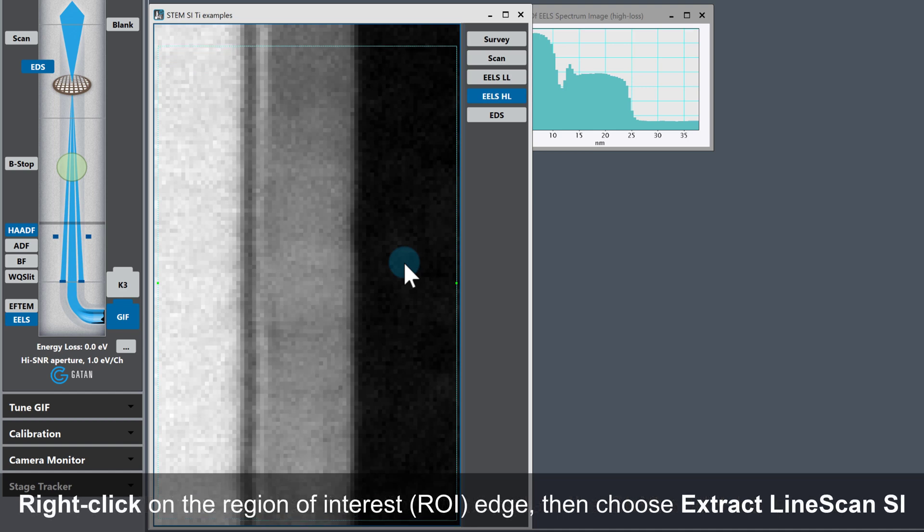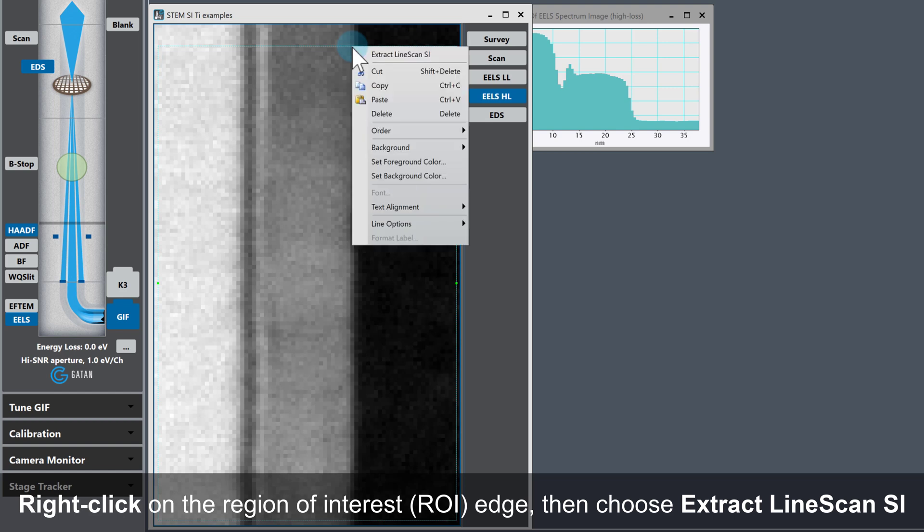Next, right click on the edge of the ROI you've just placed. At the top of the menu, there's a function called 'Extract line scan SI.' Left click on this menu item.